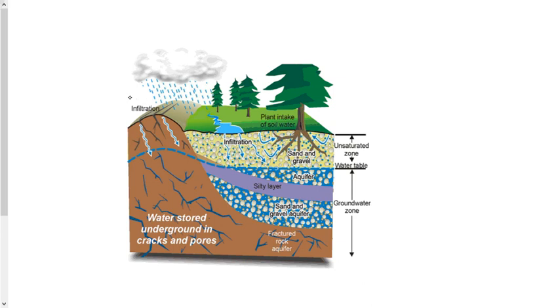This video is to explain our calcium analysis lab in water. We've been talking about solubility of different things in each other, like dissolves like. And we've also looked at the effect of temperature on the ability of something to dissolve in water. So our lab relates to the ability of calcium to dissolve in water.